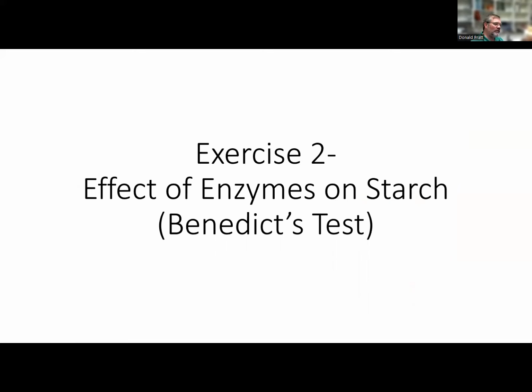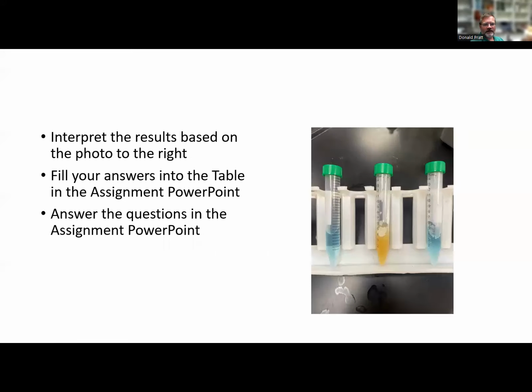So again, if you don't remember Benedict's test, you'll want to go back and review that from our previous lab. So here are the results. So what I want you to do is to interpret these results based on that. Oh, excuse me. I'm going to pause you for a second. I've forgotten to add some important information in here.